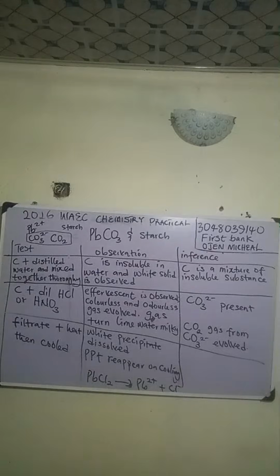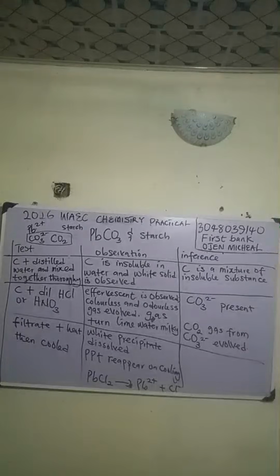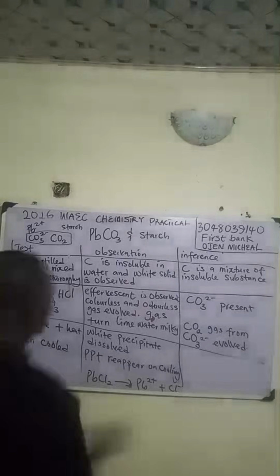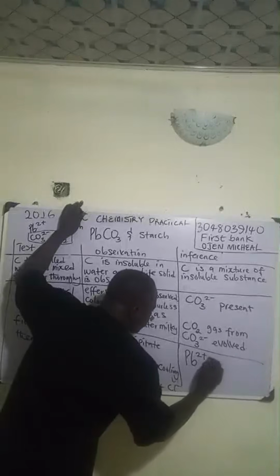Now, that's why I'm coming now. I'm just treating this one, HCl, first. I'm coming to that HNO3. Are you following? Now, what behaves like that is what? You are going to say lead ion, Pb2+ present.